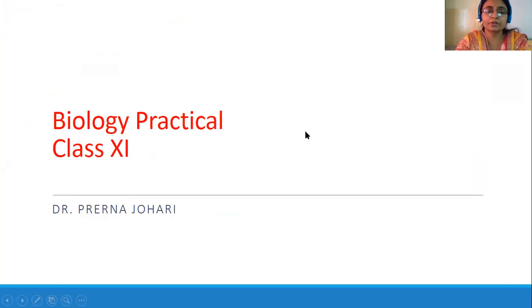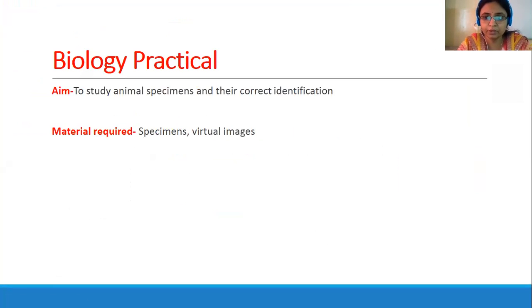Fine. So let's start with the biology practical for the class 11. This is another practical in the row. Today's aim for the practical is to study the animal specimens, and we have to correctly identify them on the basis of their diagnostic features. Fine, that we're going to study today.